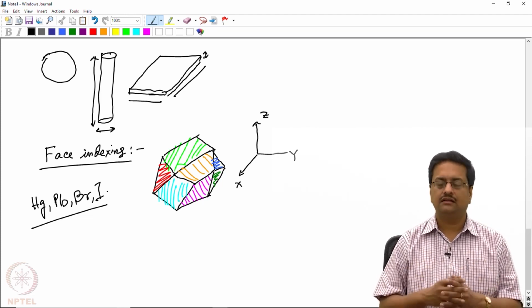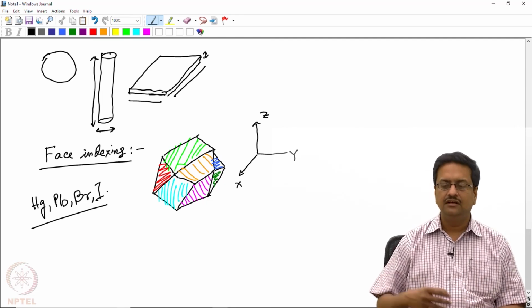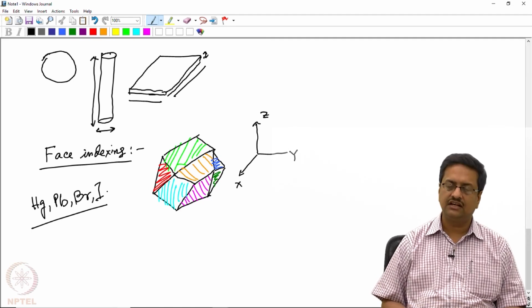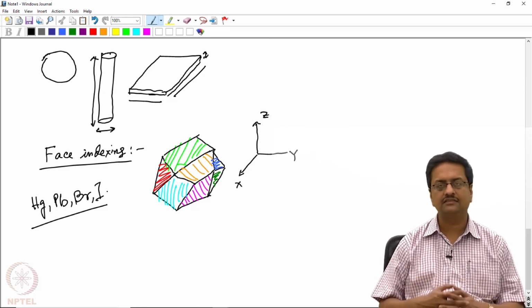By choosing a crystal of appropriate shape and size, one can reduce the effects of absorption. In case of doing data collections on crystals which are needle shaped or plate shaped, by default it is not possible to convert them to a spherical crystal.